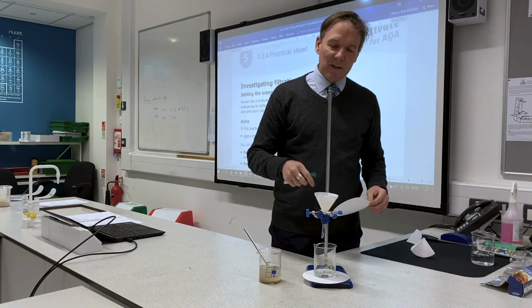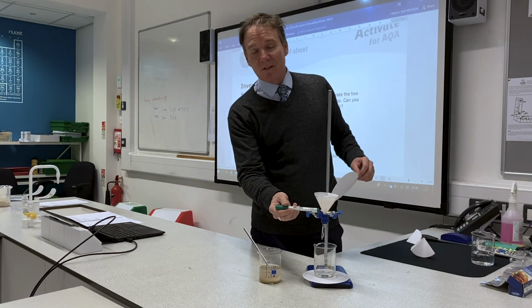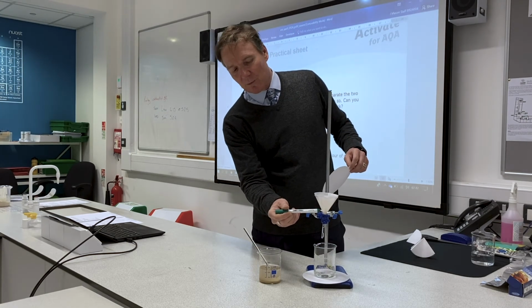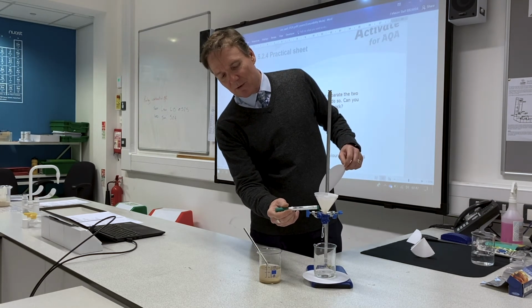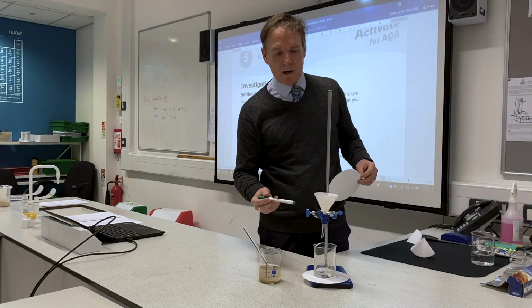And any of the solid that's left behind in the filter paper, and when this is finished, I'll be able to show you it, any of the solid that's left in the filter paper, which is around here, we call it a residue, all right? Residue just means left behind.